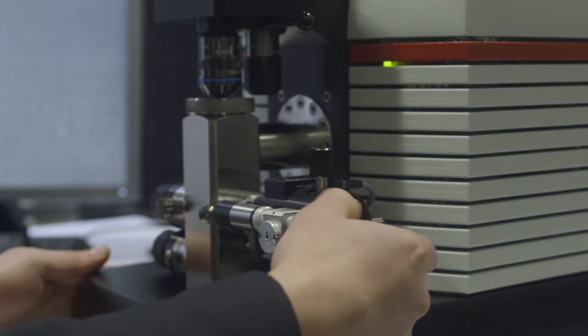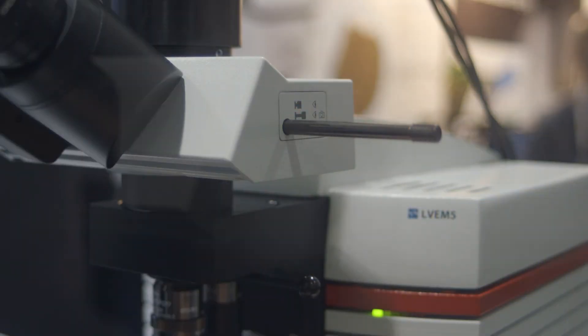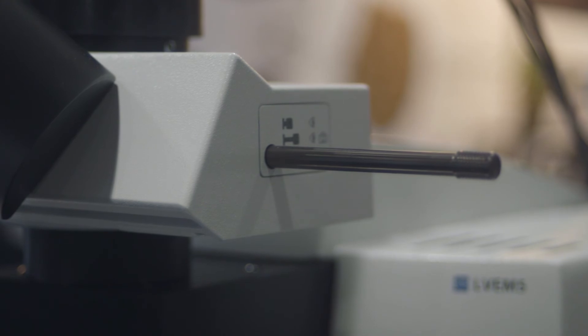In addition, these microscopes require significantly less maintenance and attention than conventional electron microscopes. In fact, the LVM5 doesn't require any service contracts in order to be run in its optimal condition.